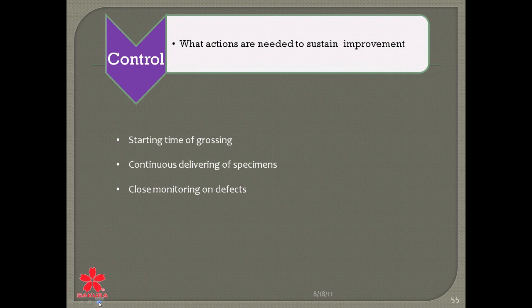We asked the hospital, and that's always difficult, especially when you're a big hospital like we were, to get all your specimens continuously coming into your lab, and you have to arrange it with the people who are getting the specimens and bringing them to you. Maybe they have a route, maybe 2 times, 3 times a day, and you have to get them to come more to your lab, and that's not always possible. But we tried it, and in the end, we made it work. We had about 10 deliveries a day, so it was really nice.